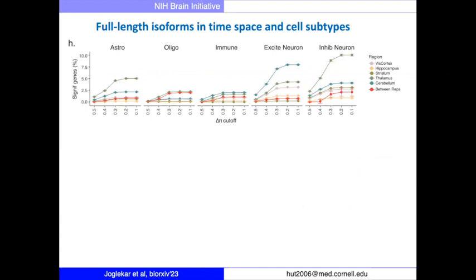So what we're then interested in is to understand the brain region specific variation. And so the first thing that we did was to downsample things so that we could compare comparisons of one brain region to all the other brain regions with a comparison of 2 replicates.